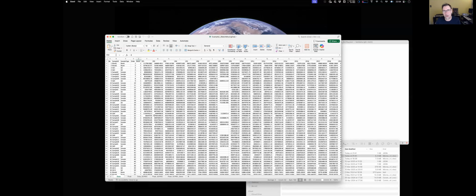If you're going to go down that road, then doing it just on the controls, the pooled sample on the controls, would be the way to go. But obviously, then you're not going to see any unique metabolites that might be in the cases.